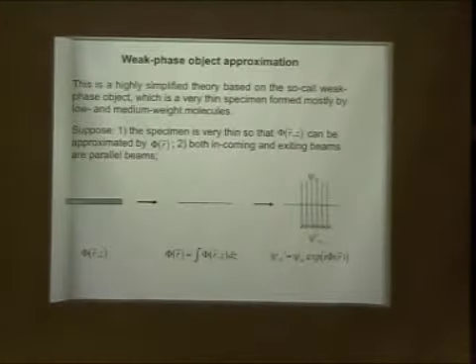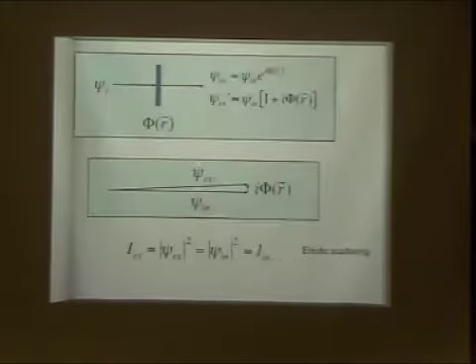If you simplify this, basically you assume that your sample is thin enough, so thin that you cannot really see anything in the z direction. No matter how thick the sample is, you assume it is a two-dimensional plane, right? You don't see anything along z. And you also assume that the incident beam undergoes elastic scattering, so that you do not lose intensity and the intensity is the same.